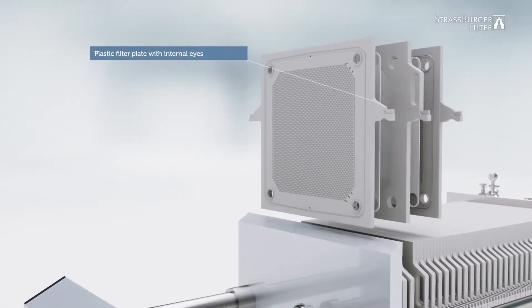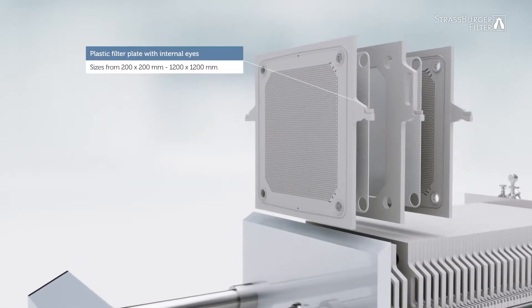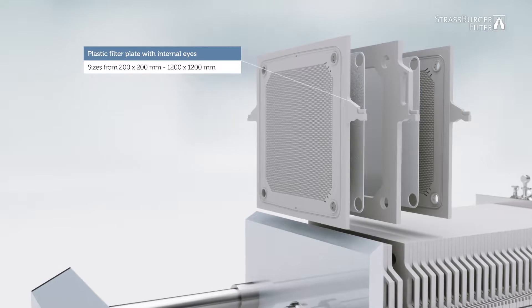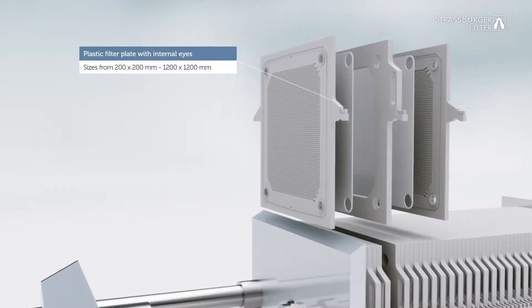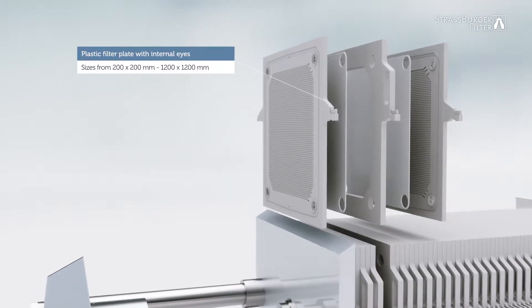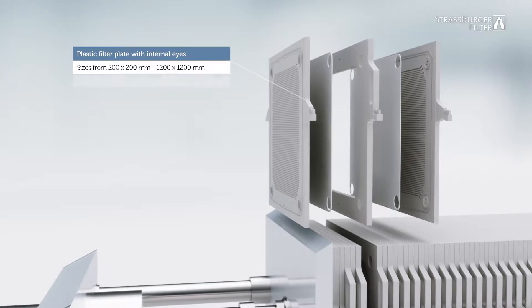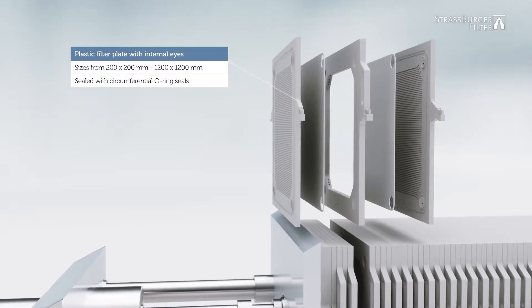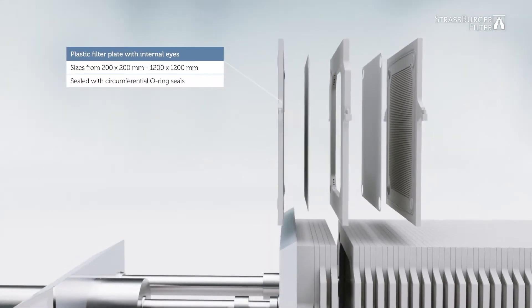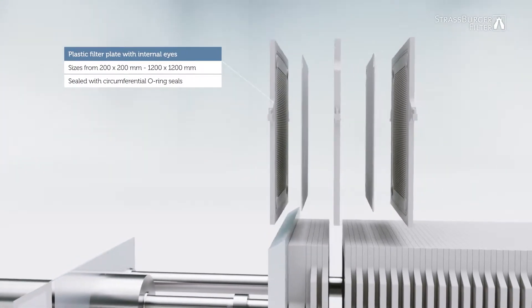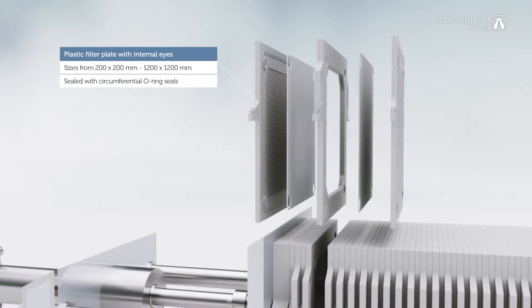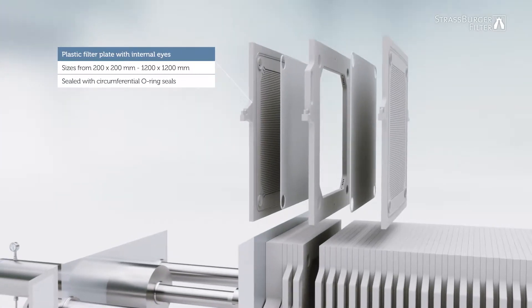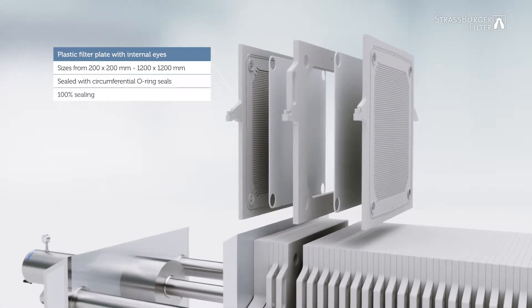Filter plates are available in sizes from 200 x 200 to 1200 x 1200 mm. Filter plates are sealed by circumferential O-ring seals and with internal filter layers. This results in 100% sealing without leaks.